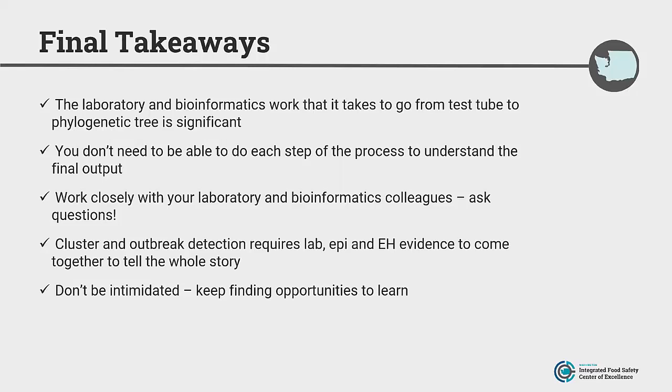So I hope that after going through all this, you're more comfortable with some basic understandings, and that if you get something from your lab, like there's a cluster of 5 cases within 0 to 10 alleles, that makes sense to you, that you would pick out that since they're saying 0 to 10 alleles, they're using MLST analysis there, and that you can understand the data that's being communicated by your laboratory.